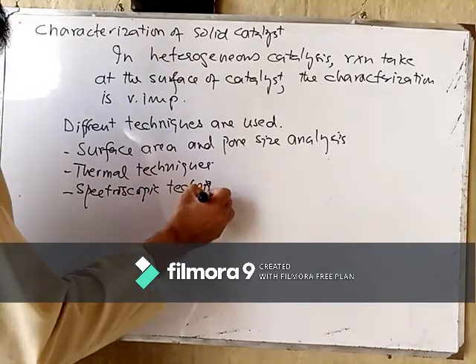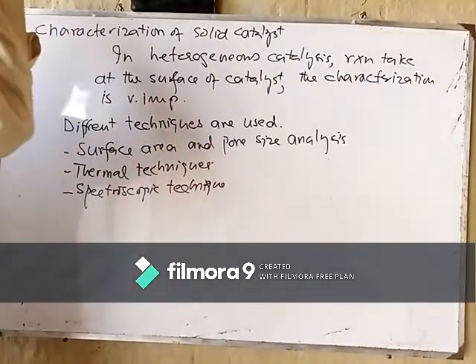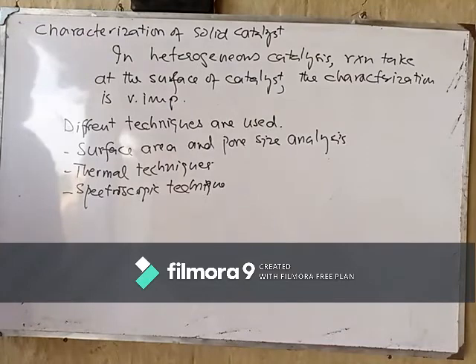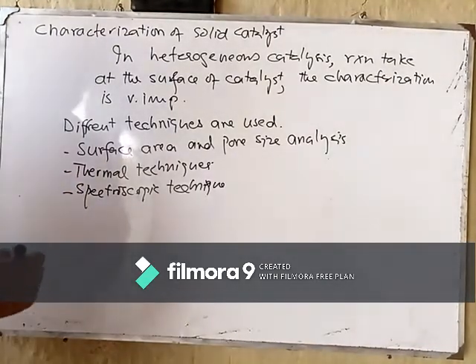These are commonly used techniques for the characterization of the solid catalyst. So first we discuss the surface area and pore size analysis.